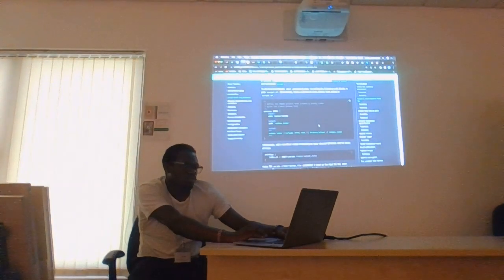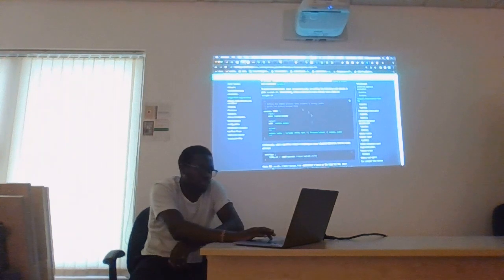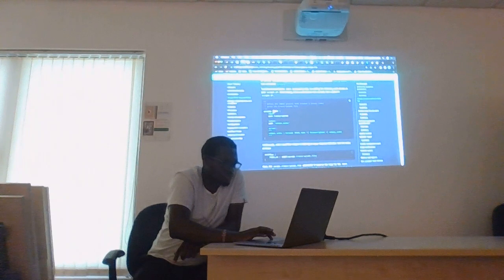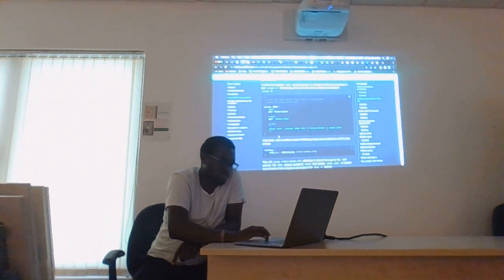Anyway, in script one we have something of this sort. So we are able to clearly see the different sections of a process in Nextflow. It should have the keyword process, the name of that process, the input given in the form of a channel, either as a path or a value, the output similarly, and the script that is going to be executed.